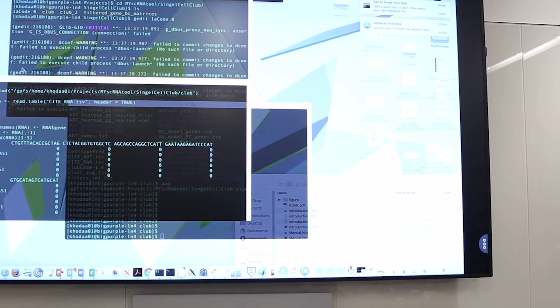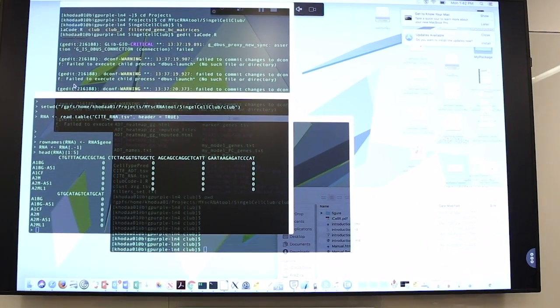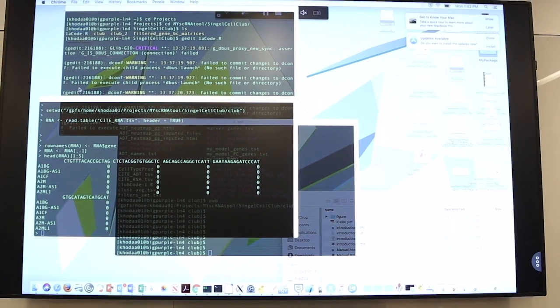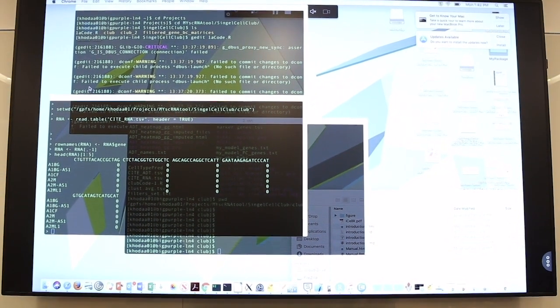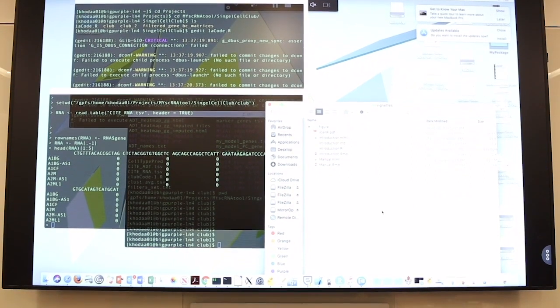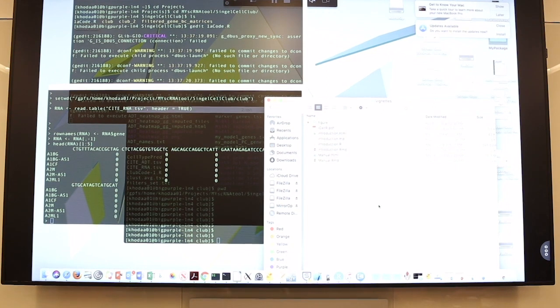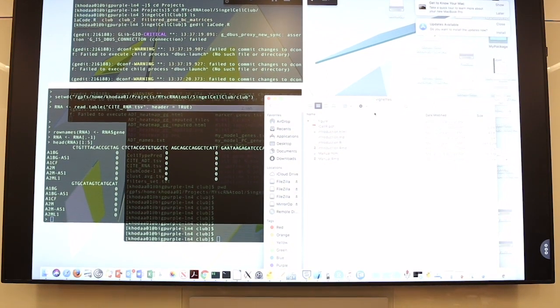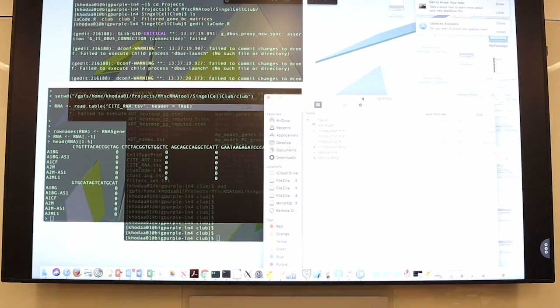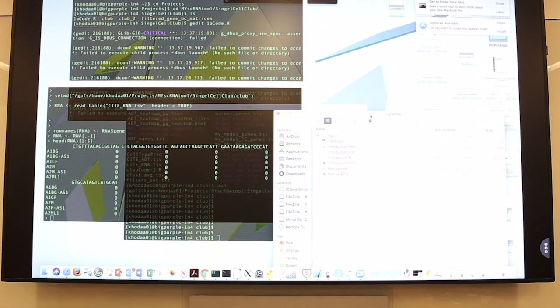So maybe you should mention that iCellR is not specific for CITE-Seq, but this analysis will help us transition into the CITE-Seq technology. You can also analyze bulk RNA sequencing too. If you have a lot of samples, bulk RNA from TCGA downloaded from other places, you can use iCellR in there too, and I can show you some of the data from TCGA as well in the end.